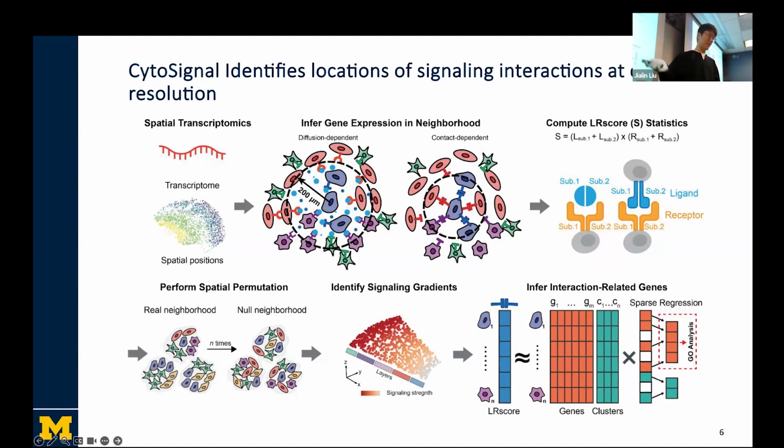We then calculate a one-sided p-value with a spatial FDR to test whether our null hypothesis is true or not. Our null hypothesis is that the signaling strength observed for a particular cell is no larger than expected based on ligand and receptor expression.